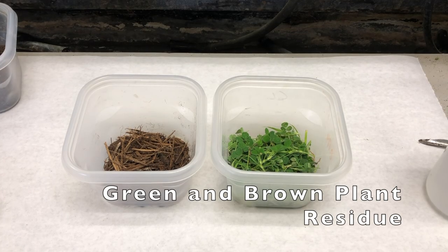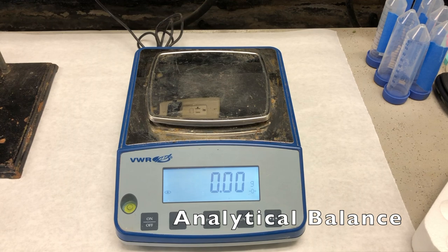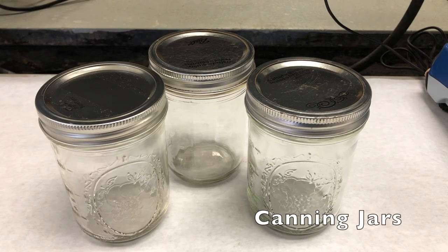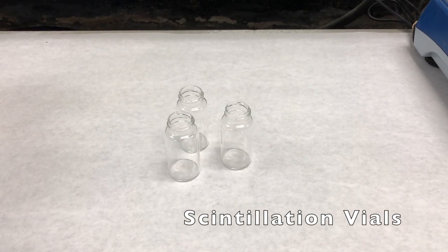To complete the first portion of the alkaline trap method you will need fresh collected soil, fresh green and brown plant residues, an analytical balance capable of measuring 400 grams or more, 3 quart or pint sized canning jars, and 3 20-milliliter borosilicate scintillation vials.